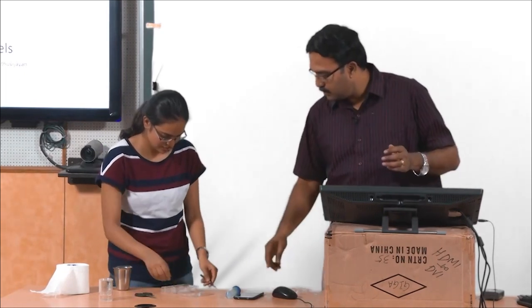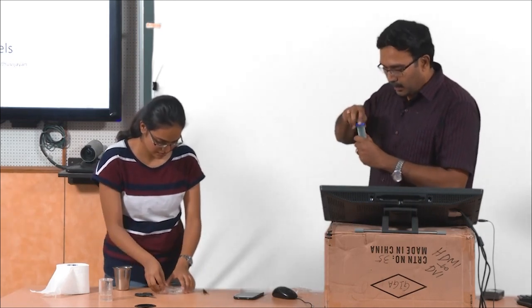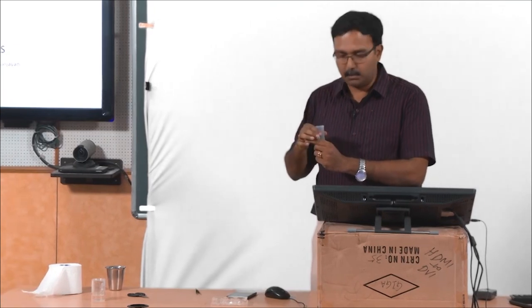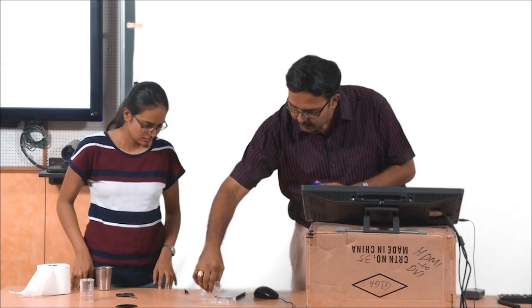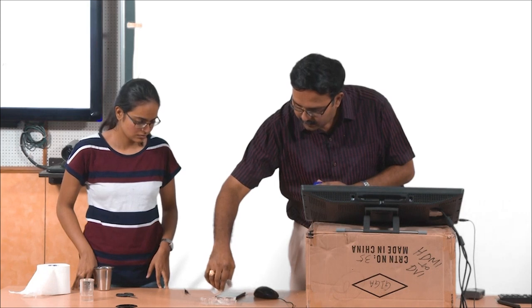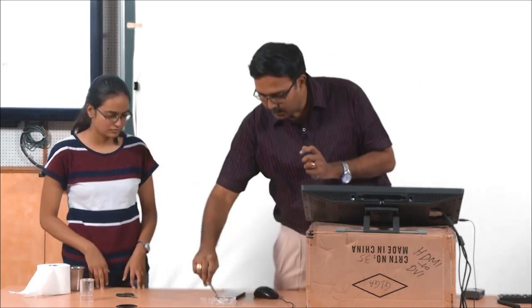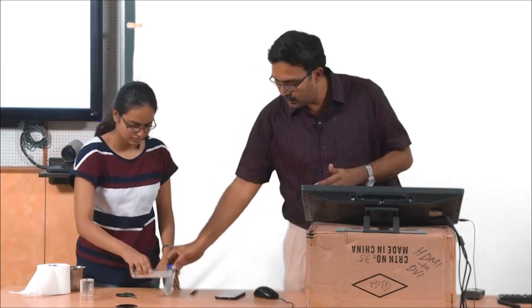You can show it around to people so that people can take it up and have a look. I am not measuring any volume of the buffer because that does not really matter — we just have to add enough so that it can absorb. What buffer are you adding? This is PBS. Let us see how well it swells and just leave it here.